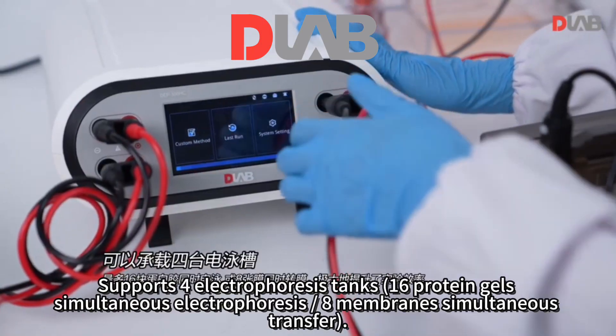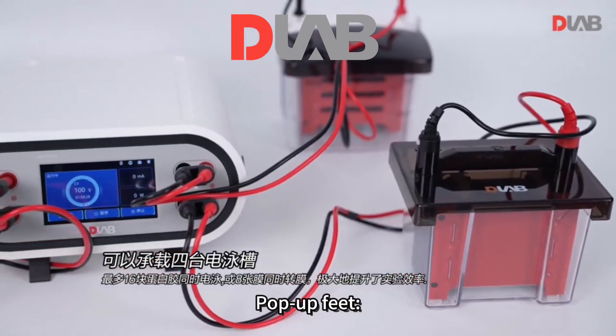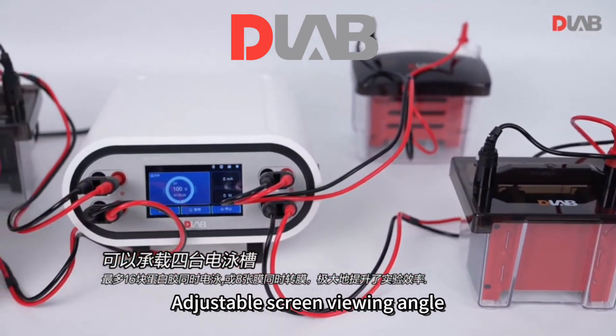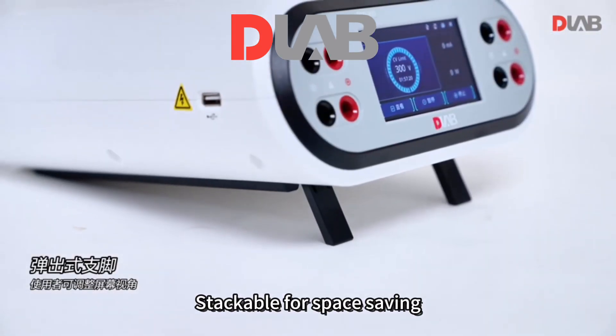Structural design: pop-up feet with adjustable screen viewing angle, anti-slip grooves and rubber strips, stackable for space saving.